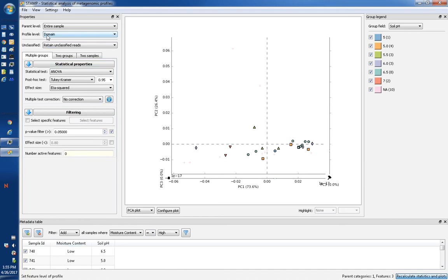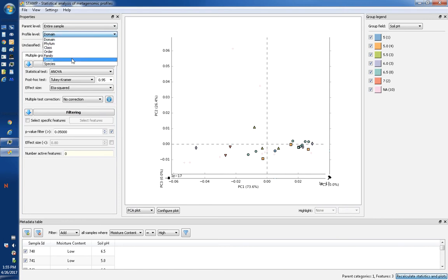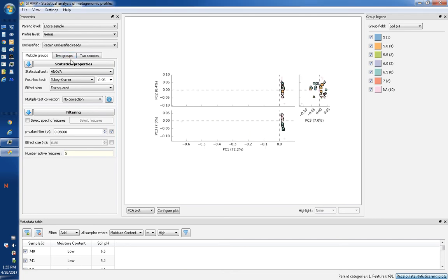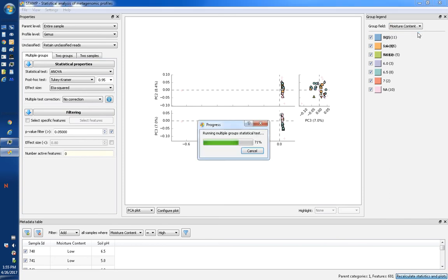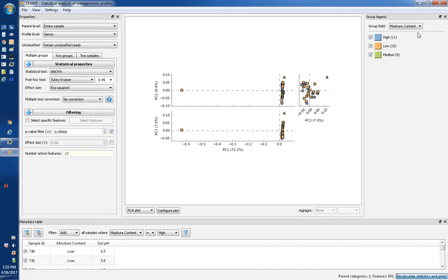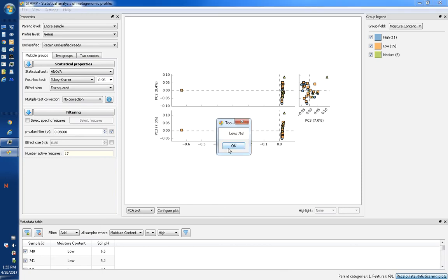Notice on the left properties panel that you can change the profile level to perform analyses at different resolutions. You can go all the way down to the species level if your data allows, but remind yourself of the inherent limitations of performing such an analysis. Towards the right, you can change the group field to perform analyses according to the groups defined in the metadata. This is how you will be ascribing biological information to these taxonomic profiles for each sample community. As a tip, when you're exploring your data, you can click on the points within the plot to get a description of what that point might indicate.